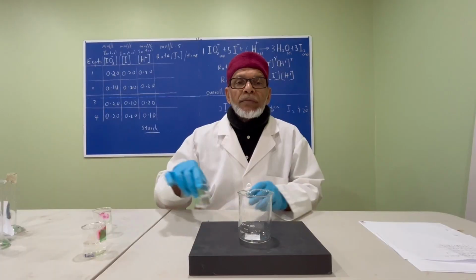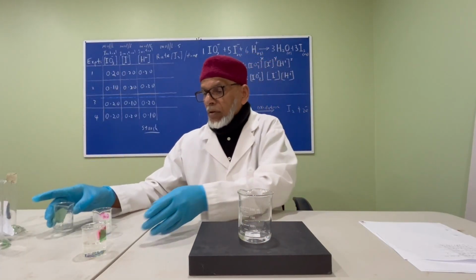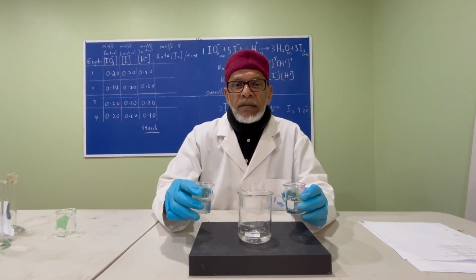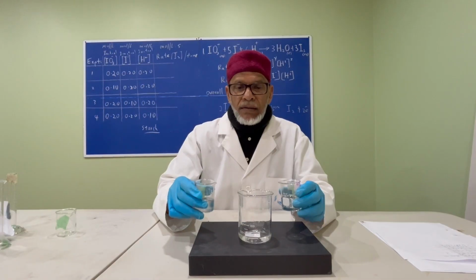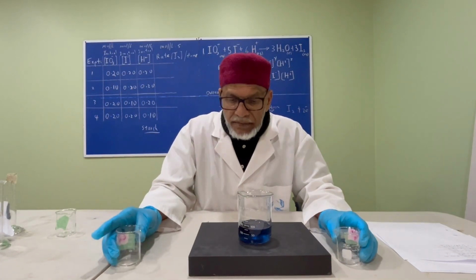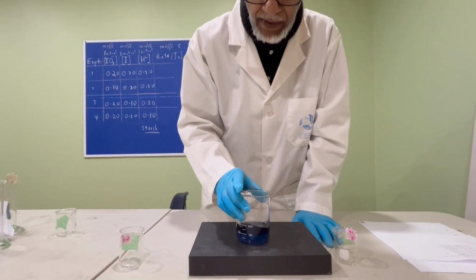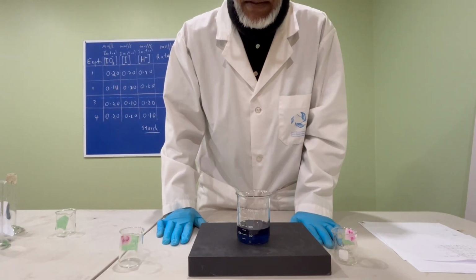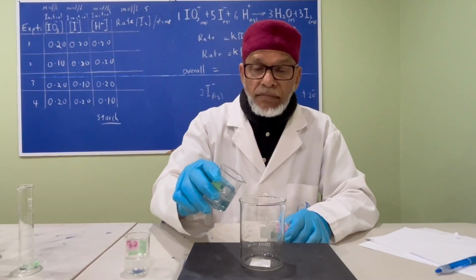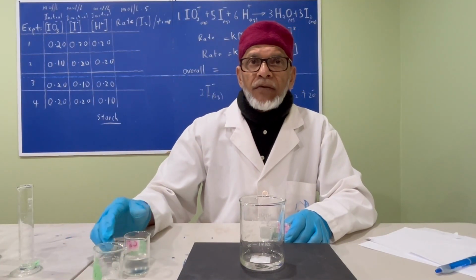So we'll start the experiment by putting in one reagent, no problem. Now we'll mix the other two together, and we register the time. I have a timekeeper here. So here we go, speed. Give it a little swirl like that. That's it. 30 seconds.